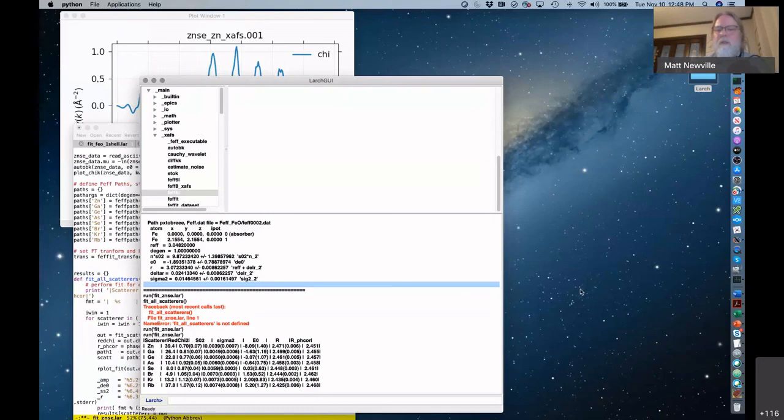So we sort of know that because different F amplitudes peak in different portions of k and R space, if you can look at that intensity map in k and R, then you can tell that things are peaking in k and R, and that can help. But I think there isn't enough experience out there in the world. There are other people who are just fitting in wavelet space. I don't think there's enough experience yet to know when it's an advantage and when it's just a cool thing.